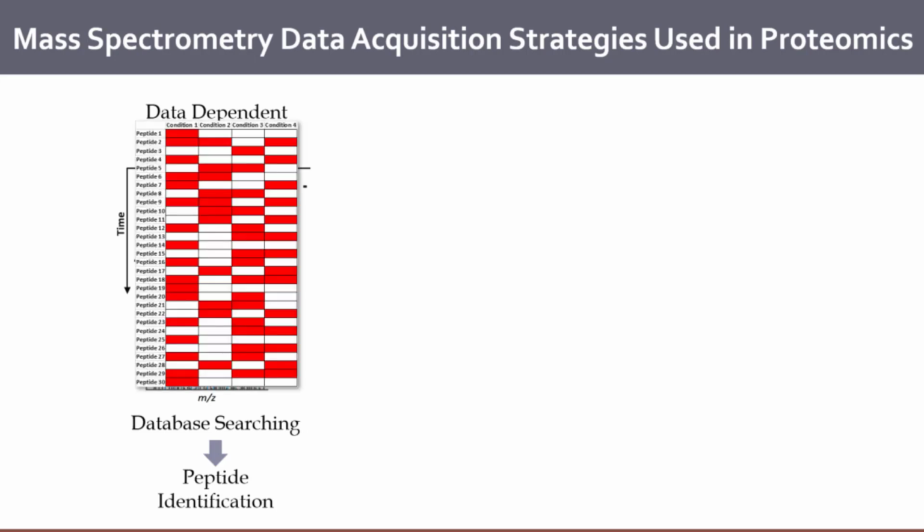The main limitation for why we've struggled with it in our lab is that if you run the same sample multiple times, you don't necessarily sample the same things, and this limits it in many ways. The other limitation is that the MSMS spectrum is 10 to 100 times more sensitive than the MS1 signal. So why are we using the MS1 signal to derive what we pick for doing the MSMS? That's the other limiting factor.